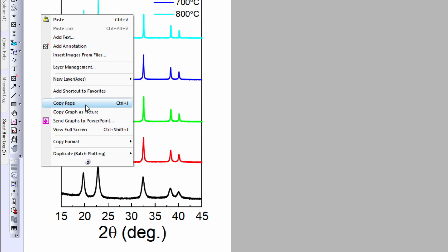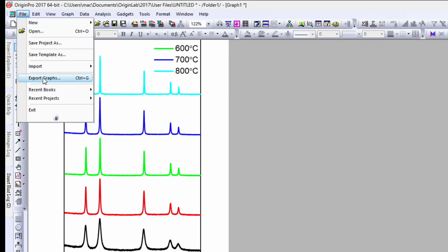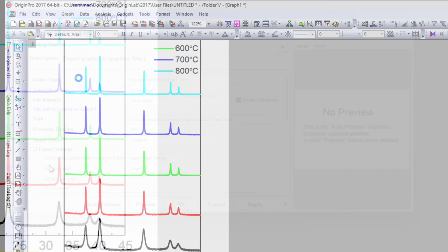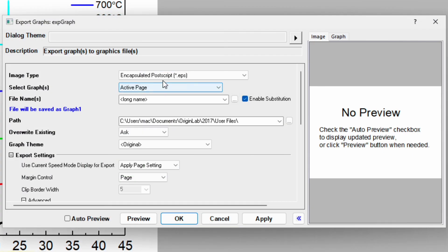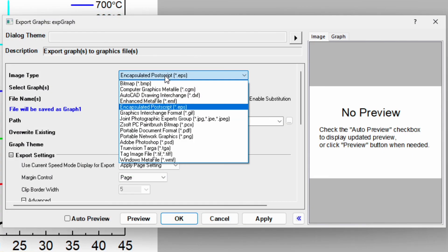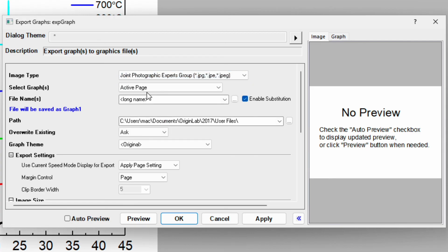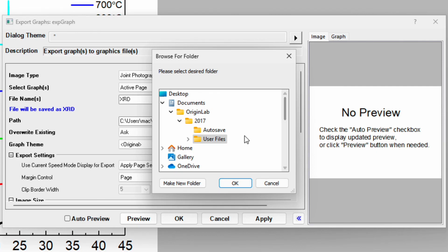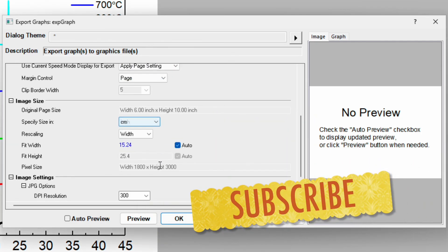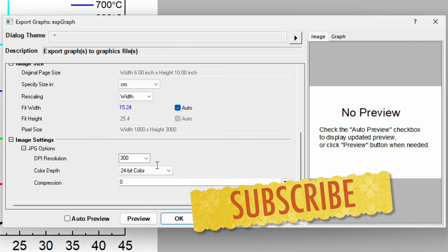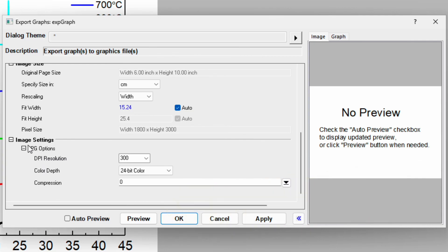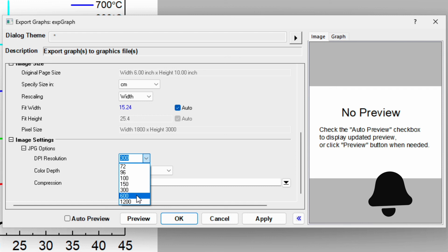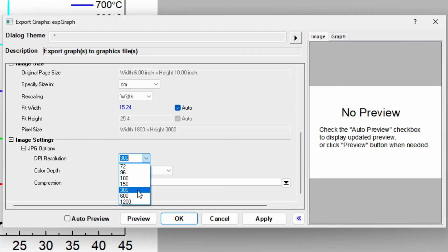Go to File, Export Graph, or use Control+G. Choose the file format - I prefer JPG. Name the file 'XRD' and select the folder to save it, which is the desktop. In image settings, choose the DPI resolution. 300 or 600 are both acceptable for research publications. I choose 600 and click OK.